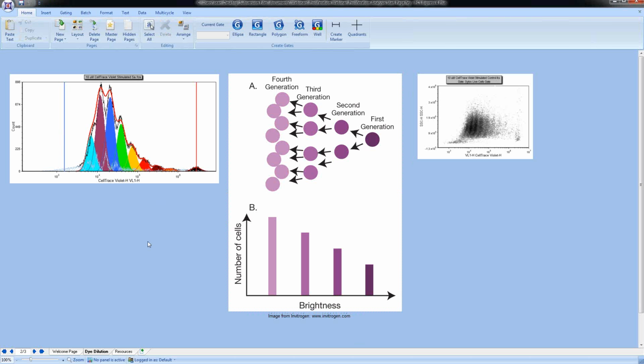Essentially, fluorescent tracking dyes can be categorized into 2 major groups. One of them is general protein labeling dyes, and if anybody has done any proliferation analysis, you've probably heard of CFSE, which is carboxyfluorescein diacetate succinimidyl ester. Essentially, what CFSE and other general protein labeling dyes do is form random covalent bonds with amino groups on cellular proteins. This results in a highly fluorescent, cell membrane impermeable marker.